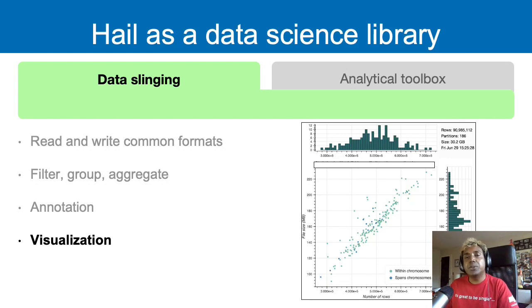Finally, visualization uses Bokeh from Python in order to produce visualizations. I personally still prefer visualizing using ggplot2, so what I usually do is actually export the data. But for the interest of your learning right now, we also do provide visualization where you can just visualize your data and import the PNG or JPEG files in order to look through them.